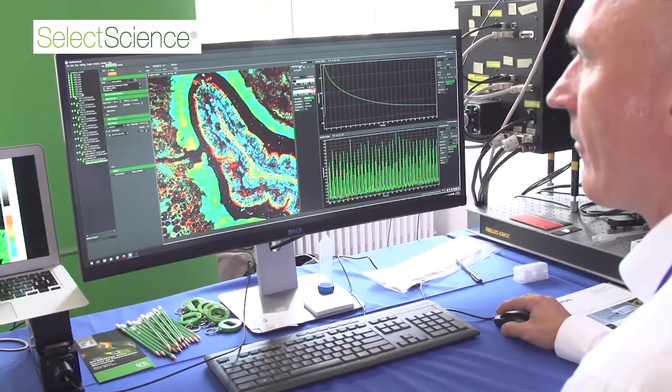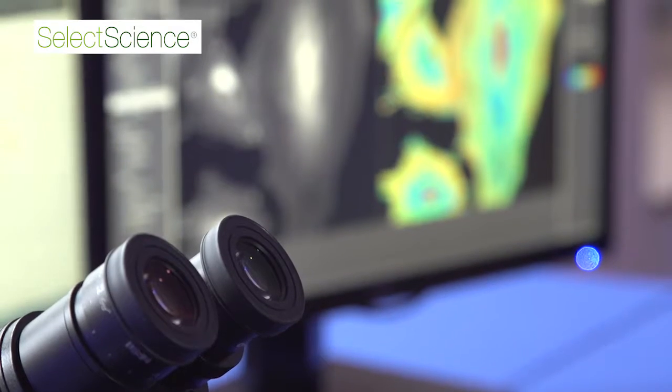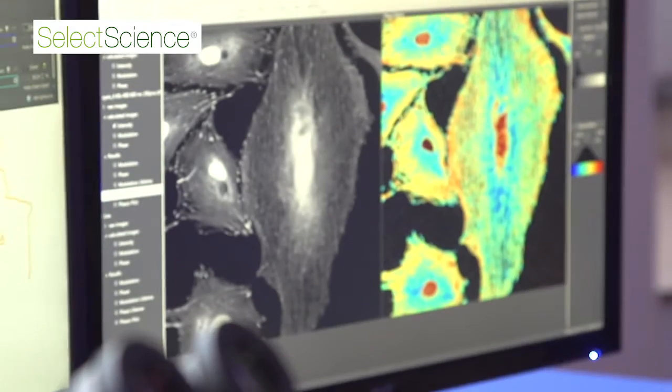We have two core areas in our facility. We do a lot of spectroscopy, so we do FLIM imaging. We look for homo-FRET and hetero-FRET to tell you something about the interaction of proteins in great detail. And we also do super resolution. There we want to go for studying super resolution in living cells and dynamic processes, interested in doing spectroscopy in living cells.